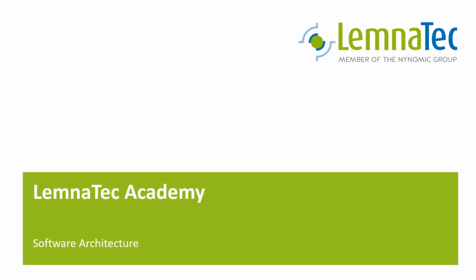This is the third video of our mini-series on root analysis. We will look into some more complex analysis to count crosses and roots and to determine how the root density changes with steps. So let's get started.